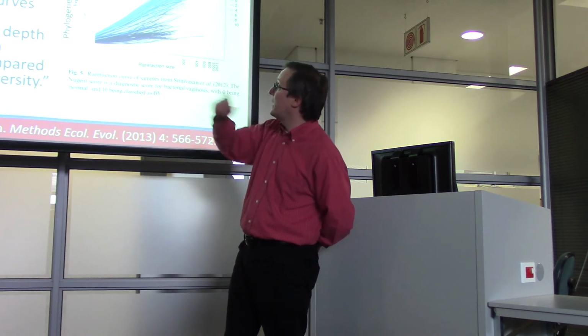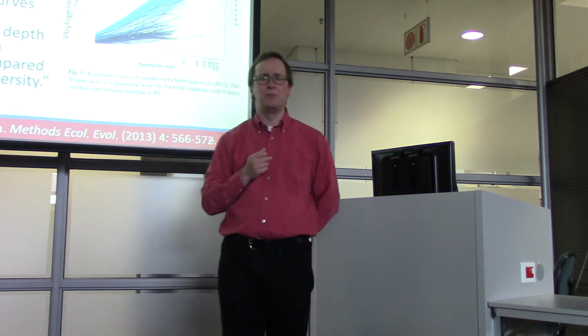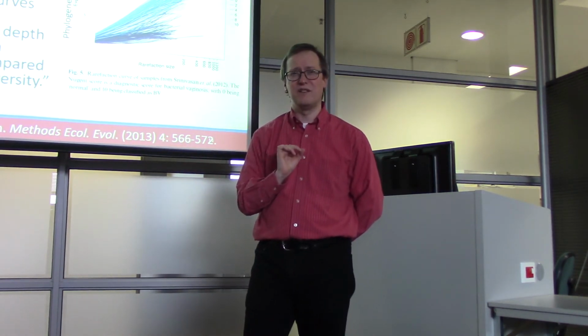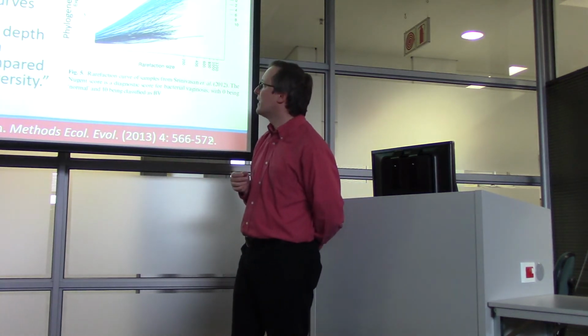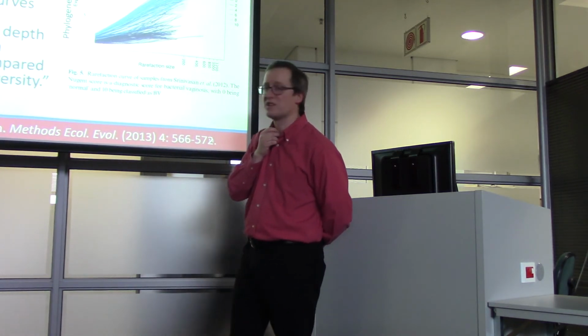So to rarefy is to take a random subset of a given size of the original sample. In statistics, you would probably see that called bootstrapping. Have you seen that term? Yeah. Bootstrapping? Okay, so rarefaction is a kind of way to do that. So rarefaction curves can be used to understand the depth of sampling of a community compared with its total diversity.